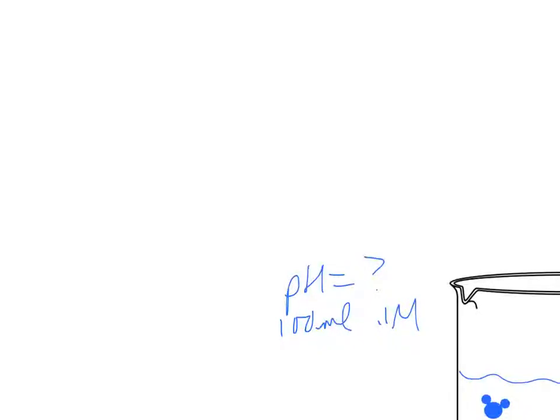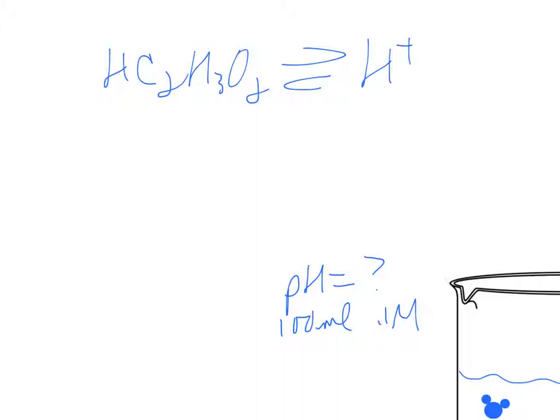was. And so I have acetic acid, and I would have done pretty much everything for this lab with RICE charts, because that's my comfort zone. That's what I like to use. The formula that's introduced in the lab is much easier. It is much quicker. We need to just go ahead and do that just because we do have a time test, but it helps for us to actually visualize what we're doing with that formula.